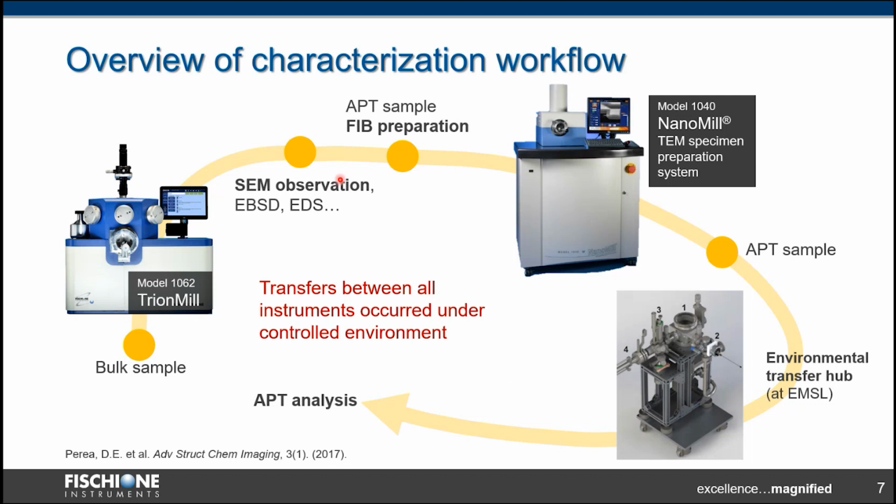So all transfers between the different instruments here are done under a controlled environment. Let me now explain in detail all the steps of this controlled workflow.